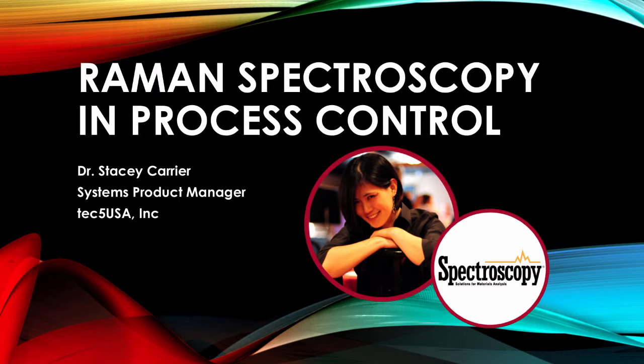Most people who are using Raman have actually taken a lab instrument and are using that lab instrument as not a continual monitoring step, but it's a verification or a recalibration step.